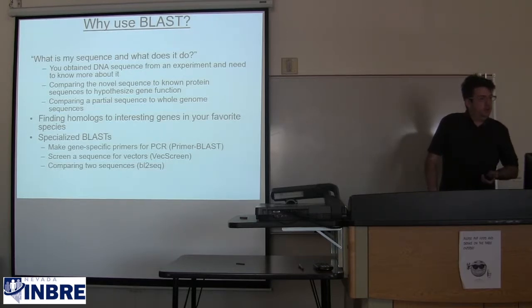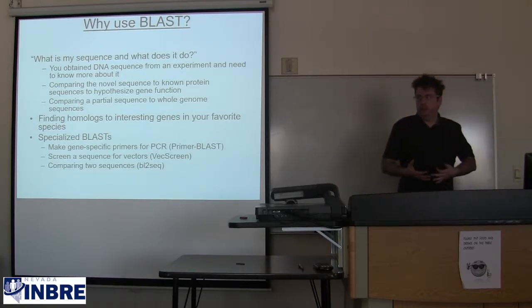Maybe you suspect that the sequence contains a protein, or a portion of it contains a protein, that might be similar to a protein that is already known to science.